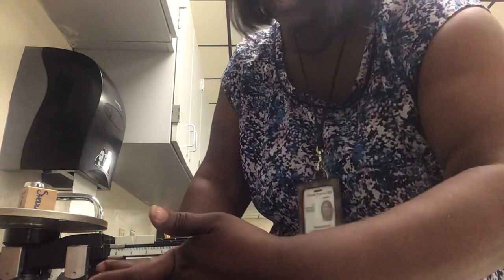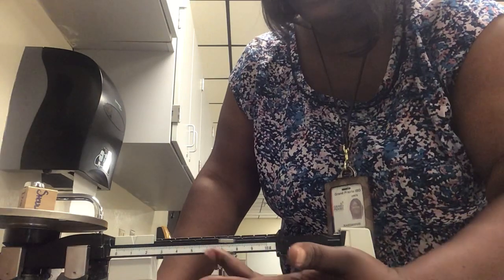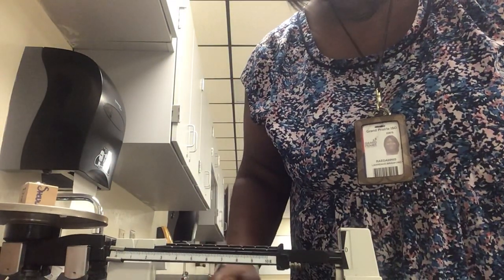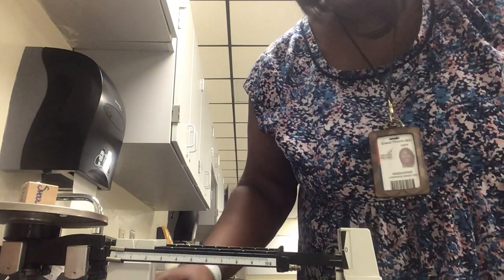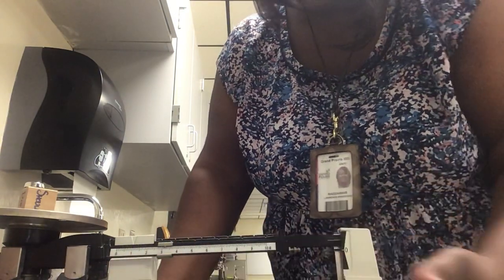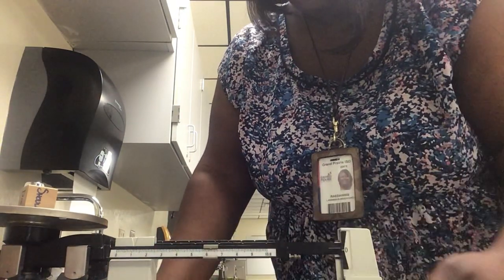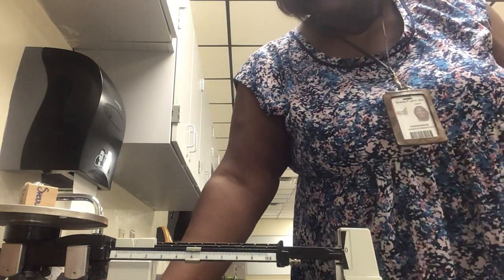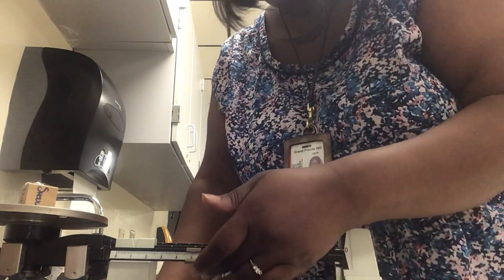I am going to slide this over to see, right? It's heavier than 10. So now I'm going to move to my 10 section. All right. A little bit heavier than 20. So I'm going to take it back a little bit to 10. Now the way this works, if it's still heavier than 10, I can come back up to my 1s to see if that helps. All right, so it's kind of moving. I'm going to take it over a little bit because remember we have to get it on 0 in order to get the correct mass.